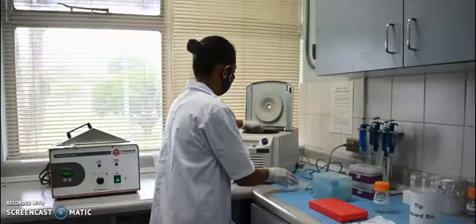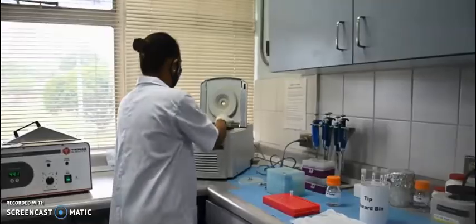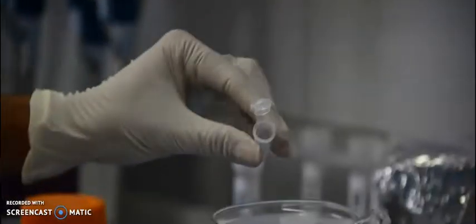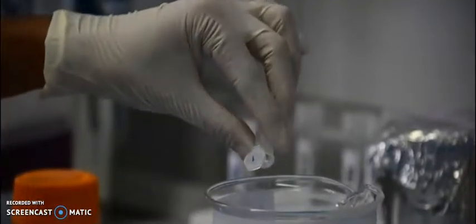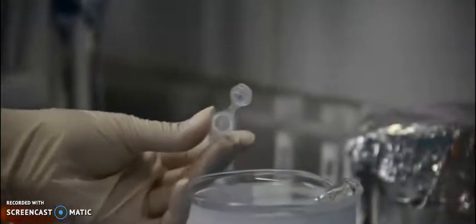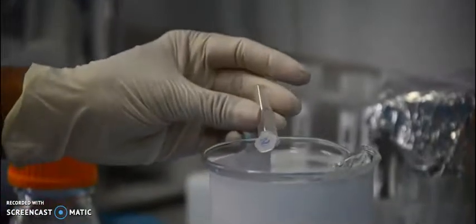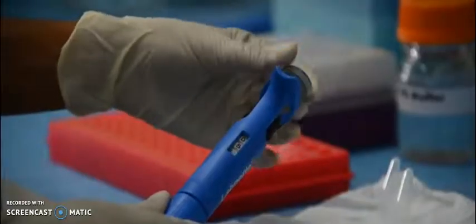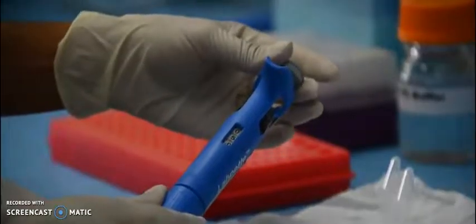After centrifuge, decant the ethanol and air dry the pellet. While pouring out the ethanol, ensure that the pellet stays at the bottom of the Eppendorf tube. Air dry the pellet.